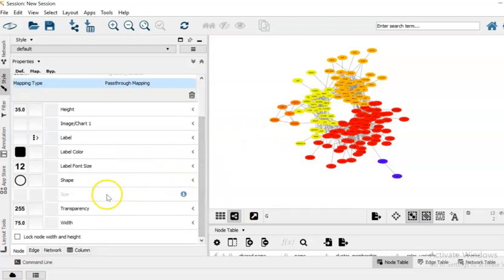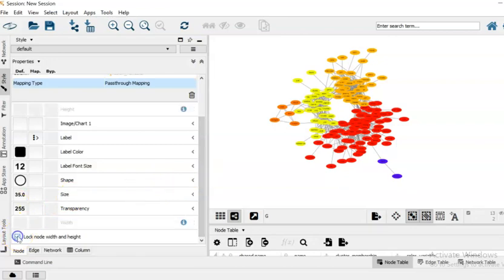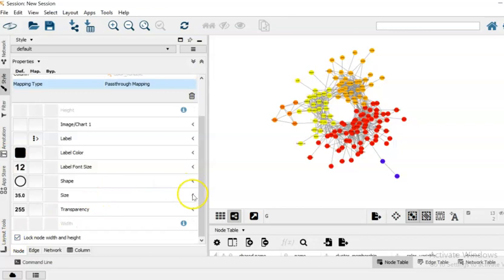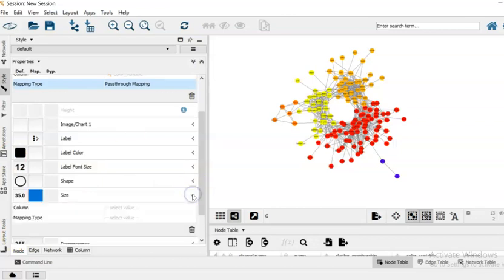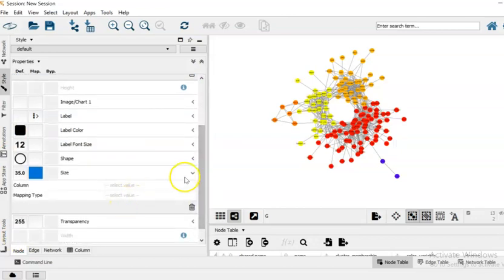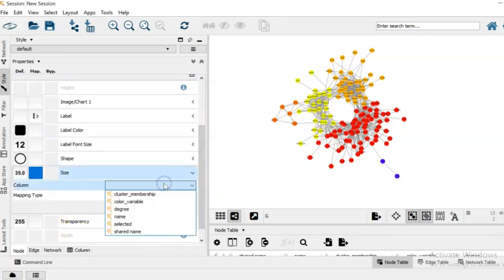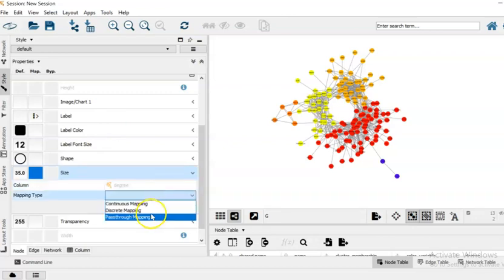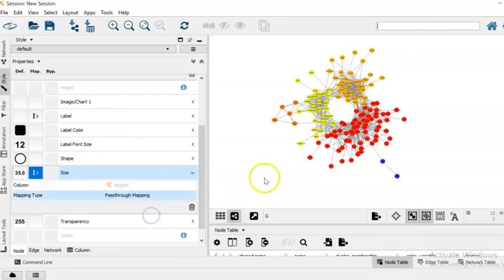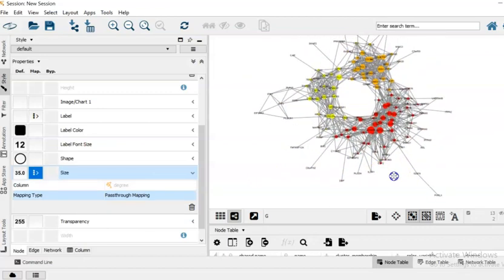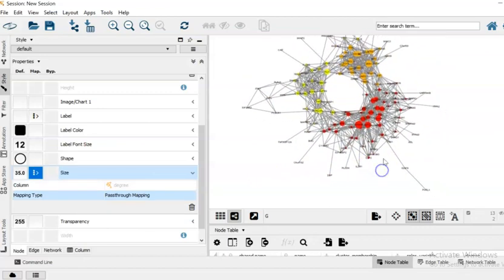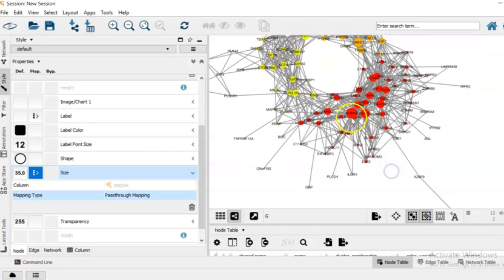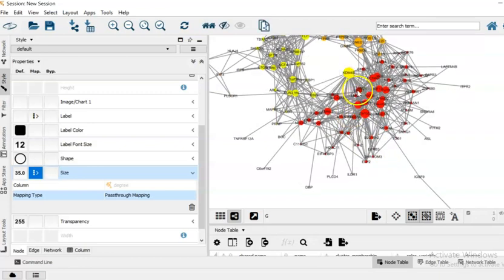And the other thing that I would like to change, at the moment the size is locked, but by ticking the lock node width and height we can unlock it. So I would select size of the vertices, then from the column I would select degree, and from the mapping type I would select continuous mapping. And now you can see that the size of our nodes are proportional to the degree, so to the number of other nodes that they are interacting with in the network.